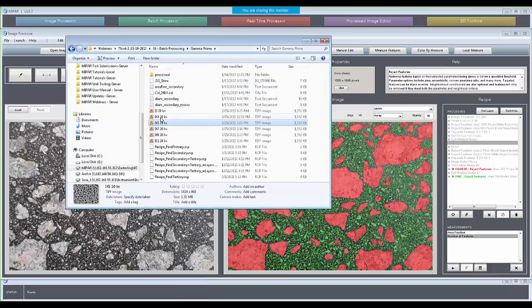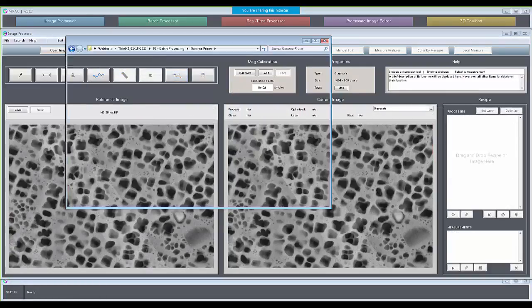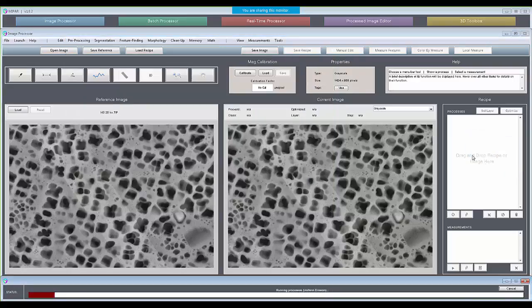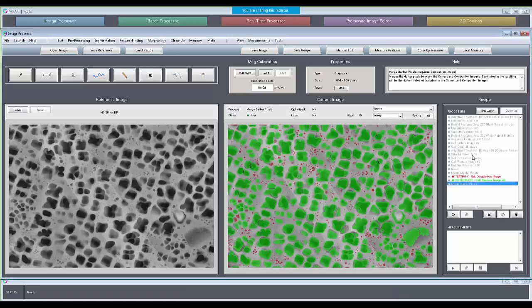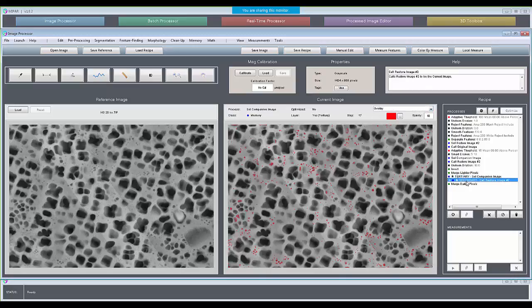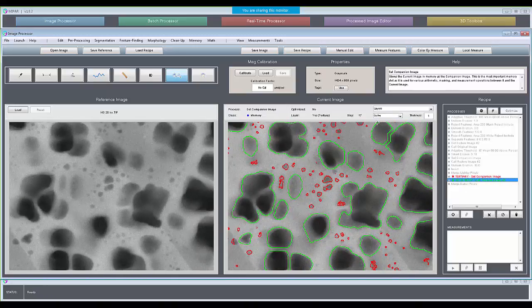We're looking at the gamma prime. So let's drag in this one here, clear the recipe out, and take our tertiary and secondary with layers recipe. So here we've just found the two different populations. Here we have secondary, here we have tertiary. We're in layers mode here. You can also show this as colored outlines instead of overlays. Sometimes that's a nicer way to show two different layers. You can also show and hide layers, I should have mentioned.